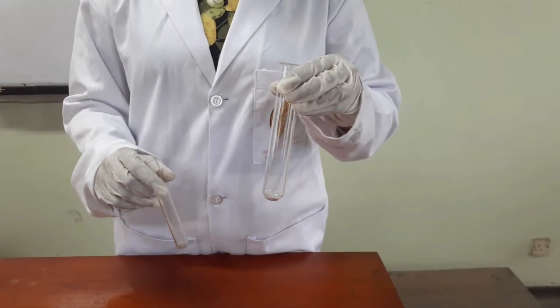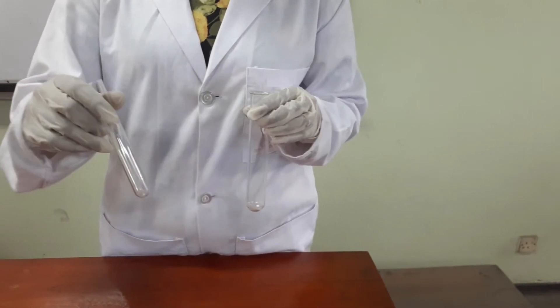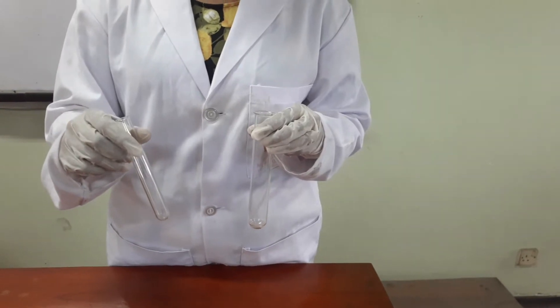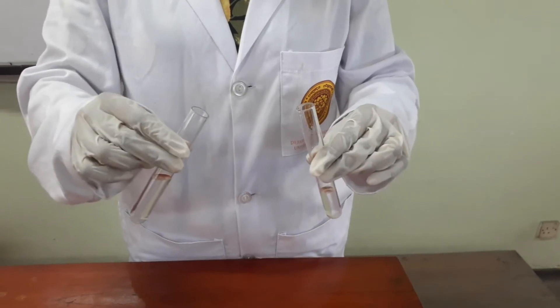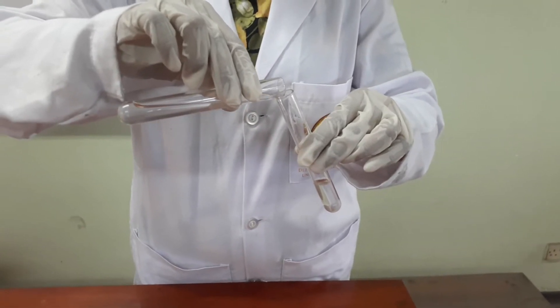This is the boiling tube which we use to heat solutions in the lab, and this is the test tube that we use to perform chemical reactions. This is one of the ways of doing chemical reactions by using test tubes.